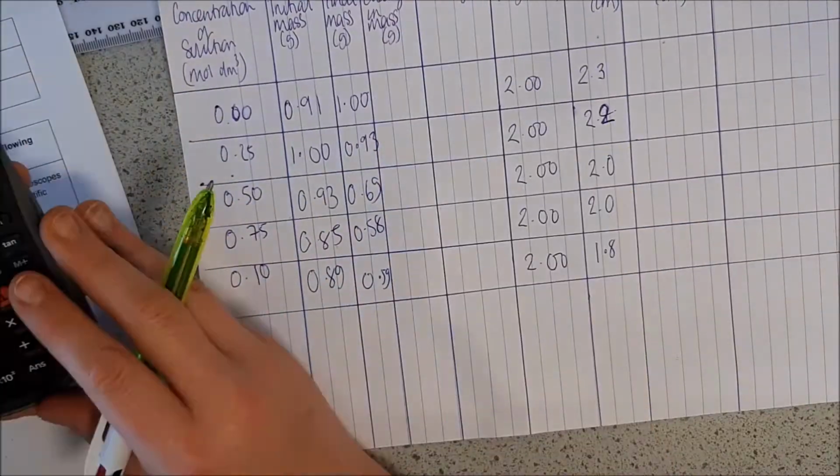Now, I haven't repeated any of this. I haven't checked whether it's reproducible, so can someone else use my method and do the same thing? I'm only going to be plotting my results, so this would narrow the validity of my experiment. I should repeat it at least 3 times, but I'm not for today. But that is something to discuss, the repeatability and the reproducibility of our experiment. Let's do a graph.